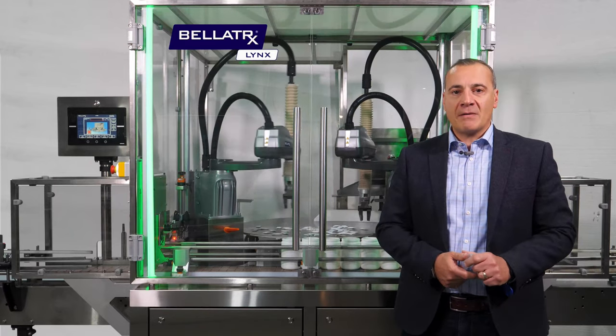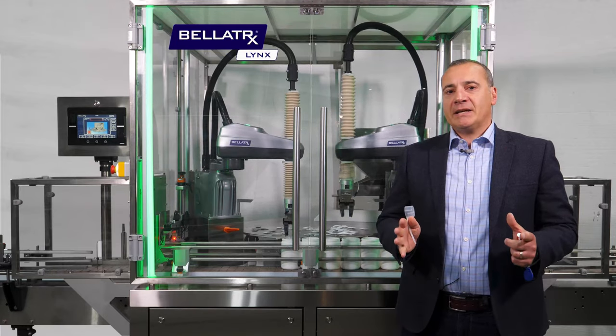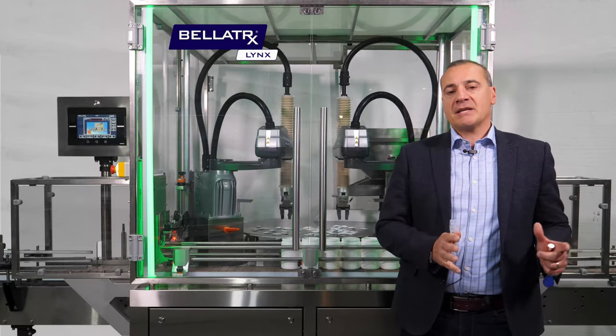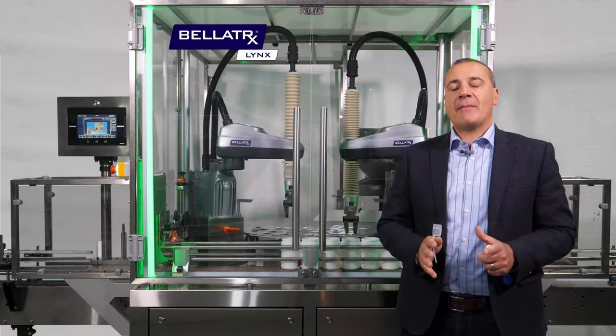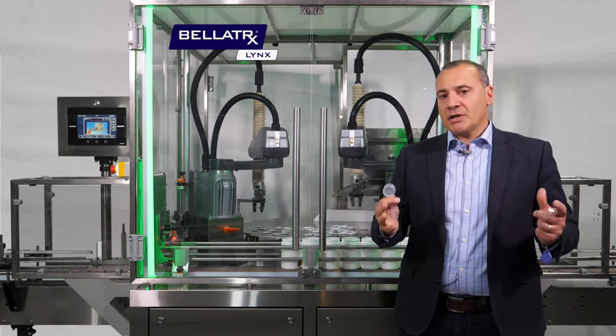Bellatrix is a leading manufacturer of pharmaceutical and nutraceutical packaging equipment, specifically geared towards primary packaging — unscrambling, filling, capping, labeling — individual pieces of equipment and turnkey packaging lines.